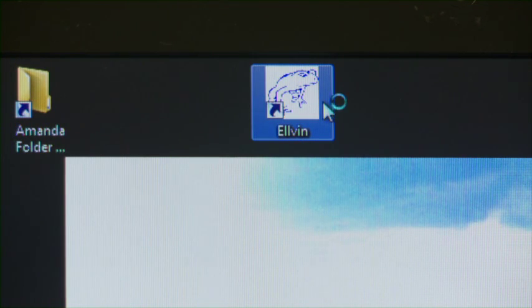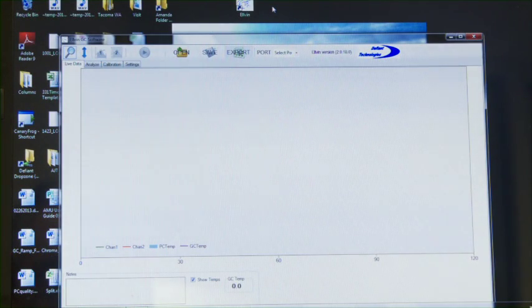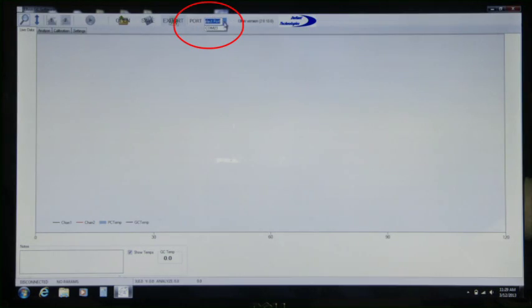The same software that is used for testing samples has special features that make instrument calibration simple. Turn on the Frog, then link to it through Elvin.